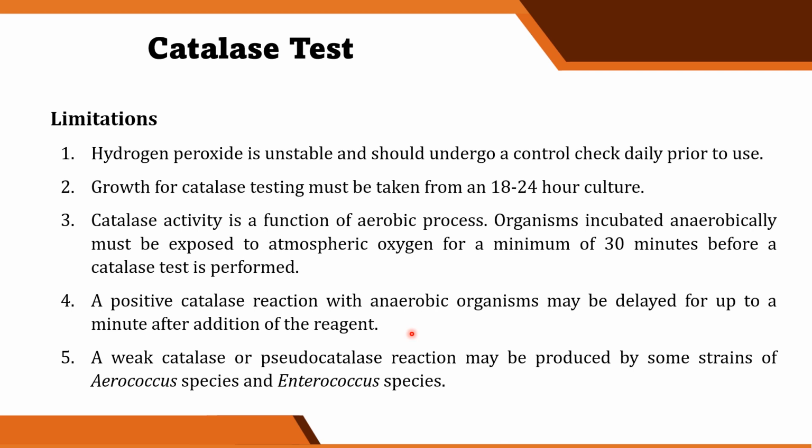siya. And then a weak catalase or pseudo-catalase reaction may be produced by some strains of Aerococcus species and Enterococcus species. Okay. So this reaction is not a true positive test. Ayan. Pag weak catalase or pseudo-catalase reactions.